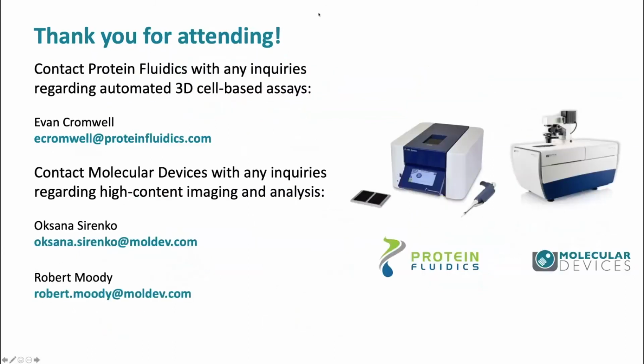Before I end up reading some of those off so that the audience can hear, selfishly, I have a couple of my own. So we did talk a little bit about Matrigel. Let me know how you release organoids from Matrigel if you happen to be performing assays and growing them in Matrigel.